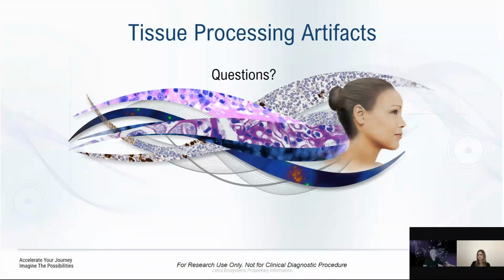But just like a box that you're taping to send off to the post office, if you keep wrapping that tape around and around and around, it's similar to what you're doing to tissue, creating all those cross links that your antigen retrieval may not be able to get off once you're getting ready to do your IHC testing. So if you can leave it at 24 hours or below, certainly don't want to do under fixation, but the closer you can get, the better IHC results you'll certainly achieve.